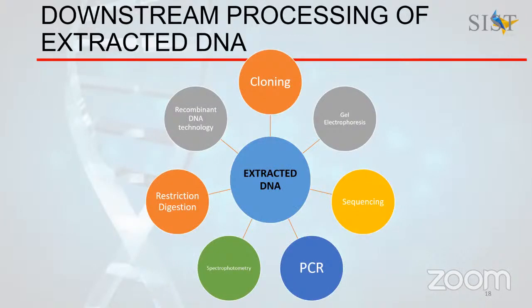So, the downstream processing of extracted DNA. The initial step in any molecular biology technique is extracting the DNA, all right? Because only after the extraction of DNA can you analyze the DNA for anything. So whatever steps take place after the DNA extraction, we can call them the downstream processing of extracted DNA, okay?